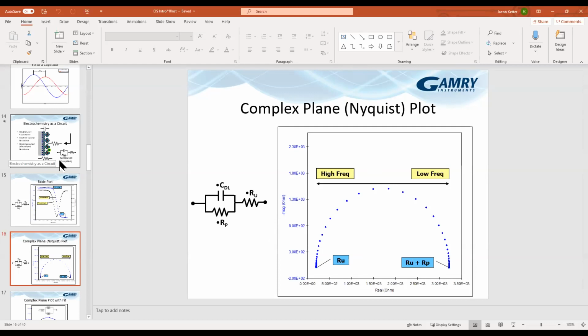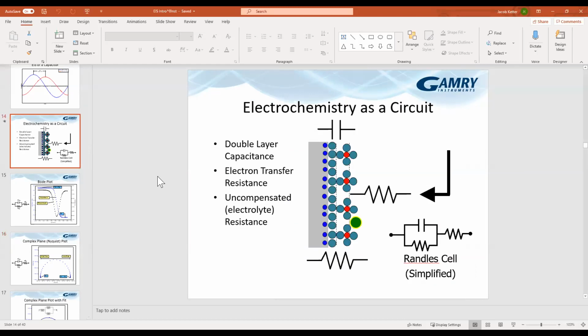Okay, thank you. We have another two-part question here: how does the working electrode geometry matter, and should we take any precautions to get accurate measurements on a cylindrical electrode?